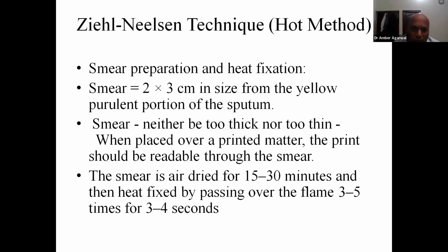The smear preparation for TB should ideally be done in a biosafety cabinet, because aerosol production will be there, and that can lead to the person doing it getting TB. There has been occurrence of staff, doctors and other persons getting infected.